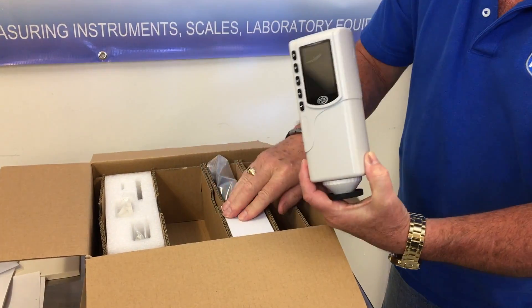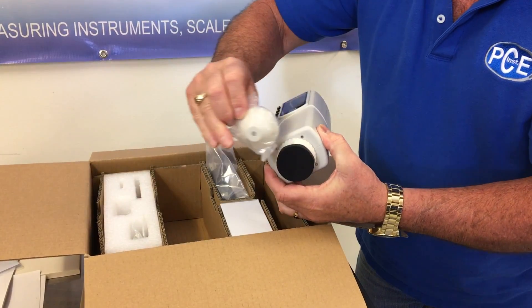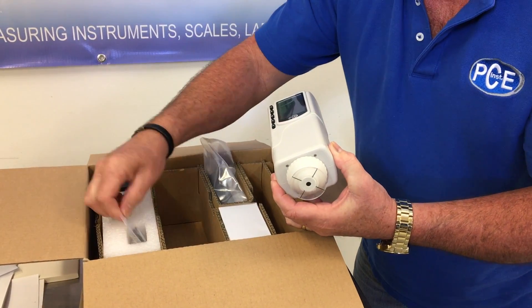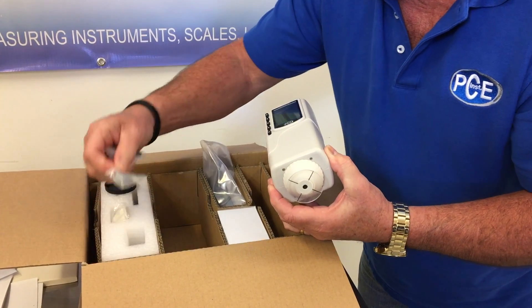We have a power adapter. We have the USB cable. We have another adapter that goes on the end. This is a dust cover. Also, we have the white space and a carrying strap.